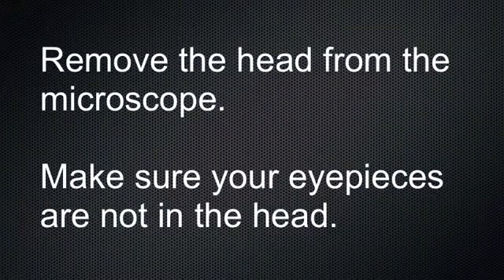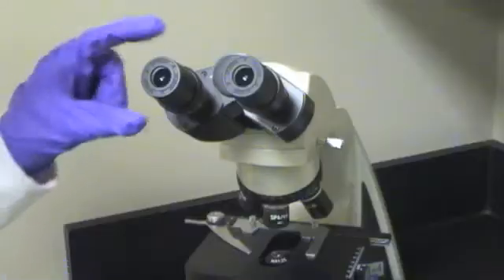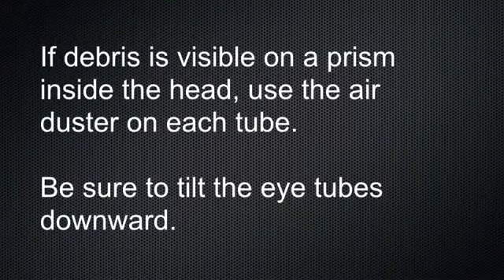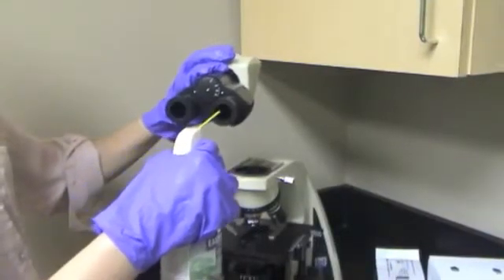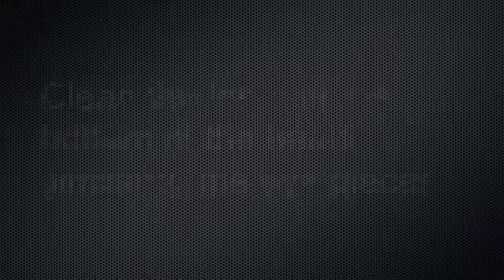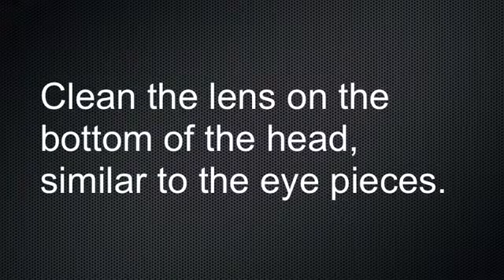Remove the head from the microscope. Make sure your eyepieces are not in the head. If debris is visible on a prism inside the head, use the air duster on each tube. Be sure to tilt the eye tubes downward. Clean the lens on the bottom of the head, similar to the eyepieces.